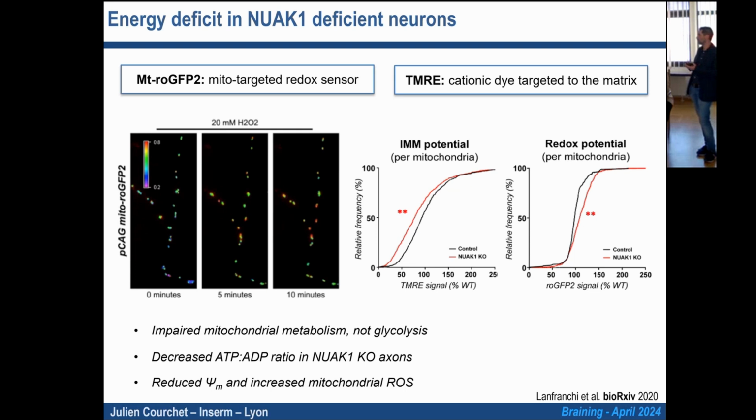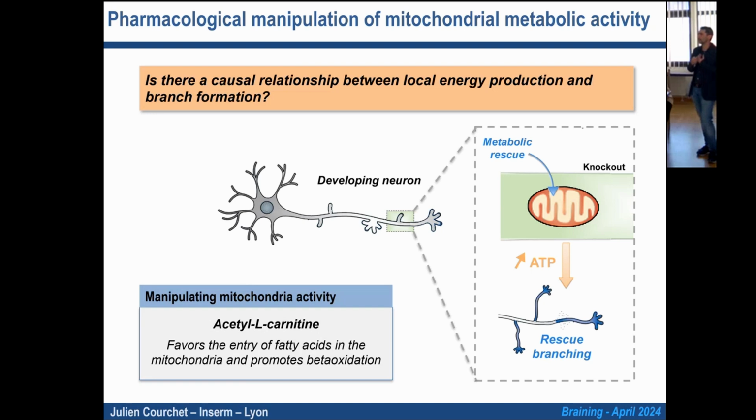And this experiment, the thing that I forgot to say, this is important for us. Why? It's because I told you that in knockouts, mitochondria keep moving all the time. So moving using molecular motors is something that is using ATP, right? So we wanted to be sure that those mitochondria are actually defective and not that they work normally, but it's just that because molecular motors are so much upregulated that the ATP that is produced is immediately being used by those molecular motors. With this type of approach, what we can tell is that single mitochondria, whether moving or not, are actually less efficient at producing ATP.